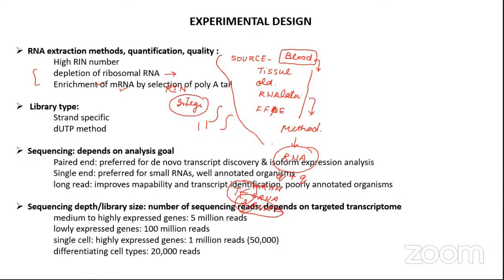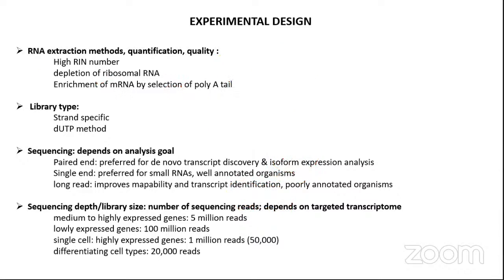So we have to deplete this. Usually tRNA will not affect the analysis and sequencing, but we have to decide the method when we are preparing the library: whether we are enriching our mRNA or depleting the ribosomal RNA. We will see what to choose and what not to choose.